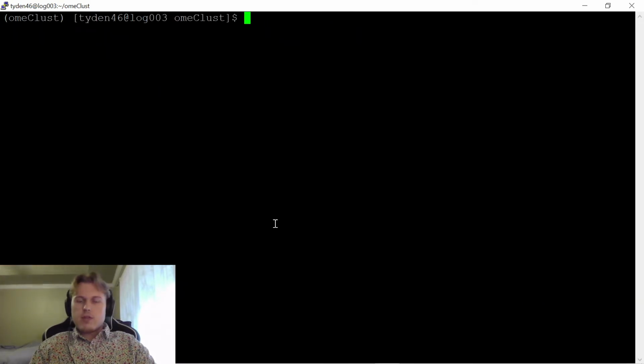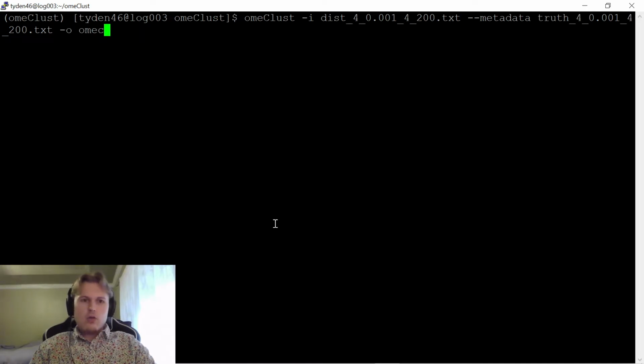All right, now that we've installed omeClust, we kind of know how it runs. Let's go ahead and run it. So we're going to invoke it with omeClust. I'm going to do -i and give it my distance matrix. I'm going to do --metadata, and I'm going to give it my metadata file. I need an out folder, so I'm going to call this omeClust_out.